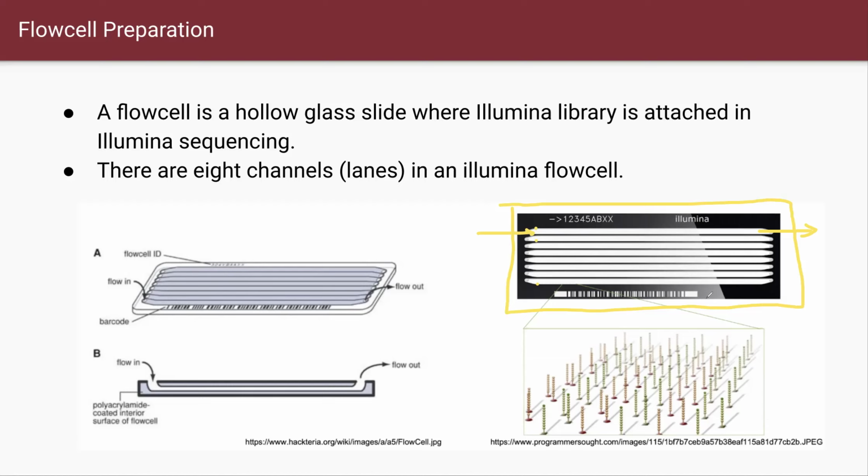So this is all automation. This enables an automated process out of that information. And this flow cell also has an ID, which is like this, characters 1, 2, 3, 4, 5 and a character on here. And this information will be stored in the data as well. So when you do the bioinformatics analysis, you get to know which flow cell the data is from, right? So this is also something you have to keep in mind.